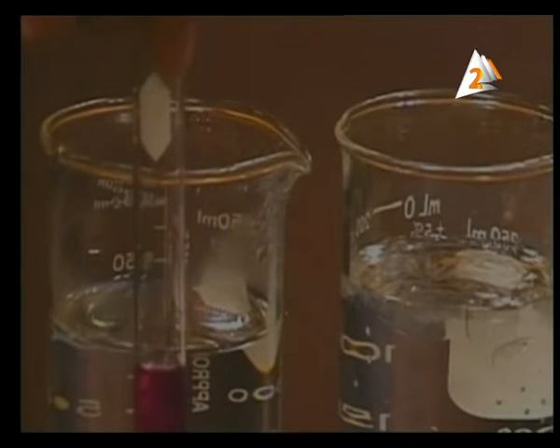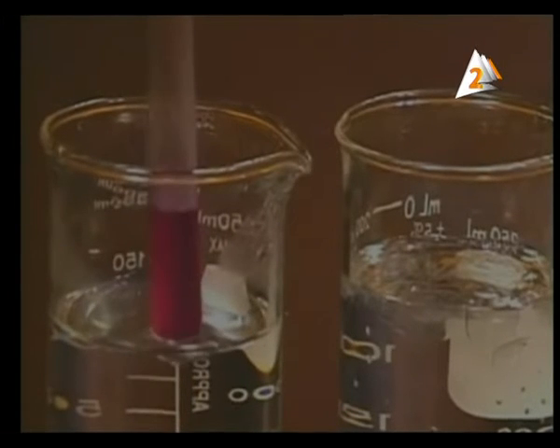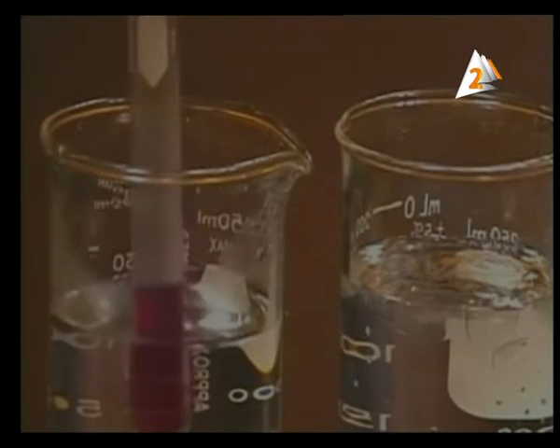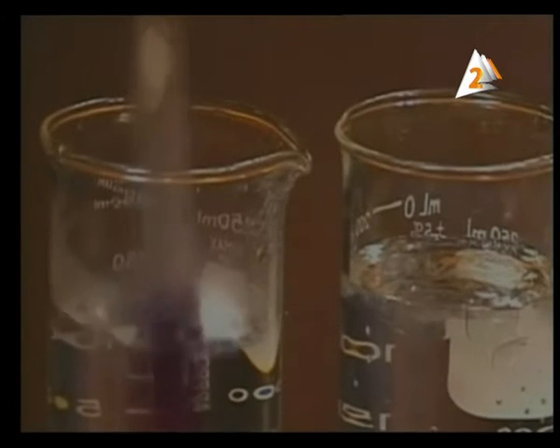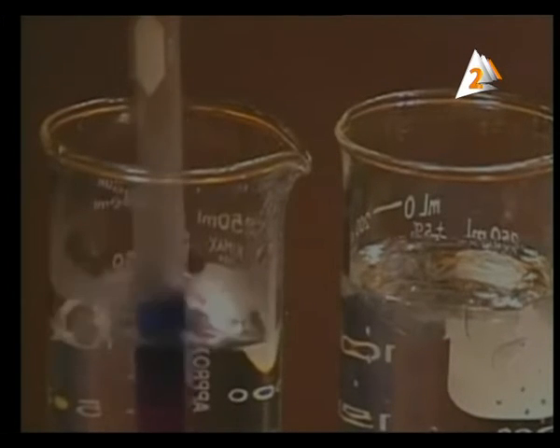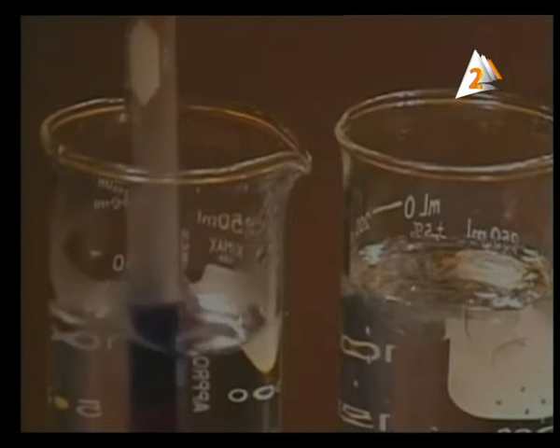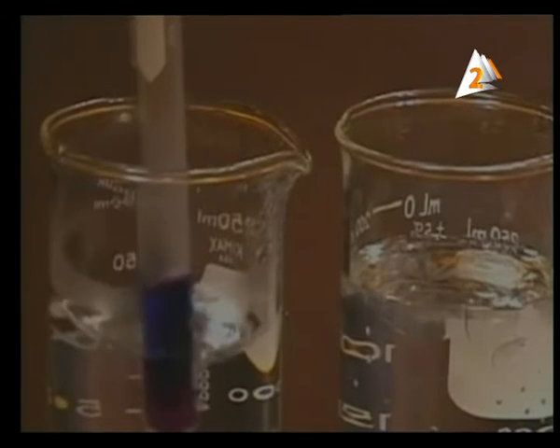If you put these molecules of cobalt chloride in the hot water like this, we will see more reaction happening here. From time to time, you can see the collisions here change the color of the tube. This means the color will change from pink to blue.